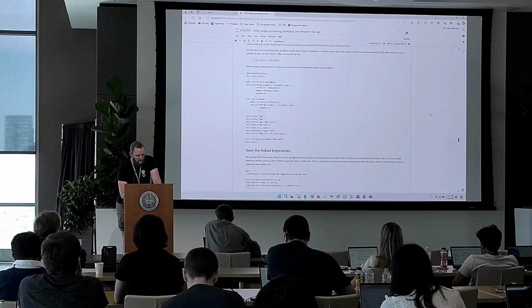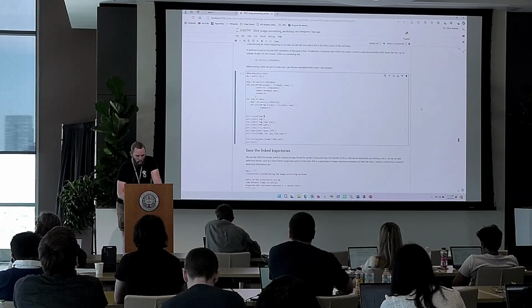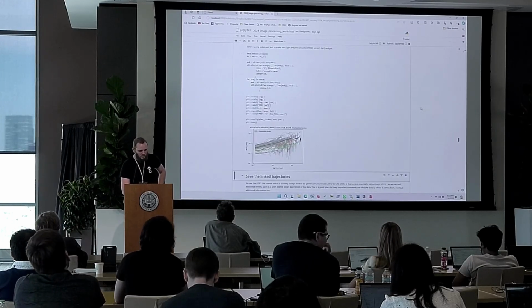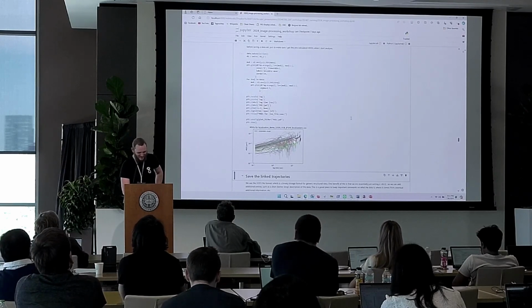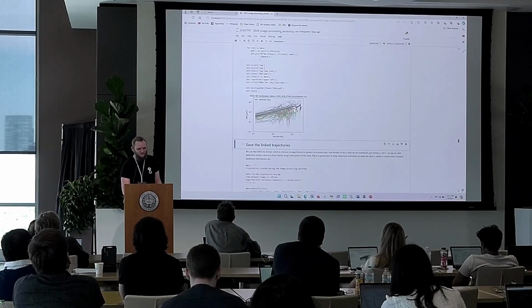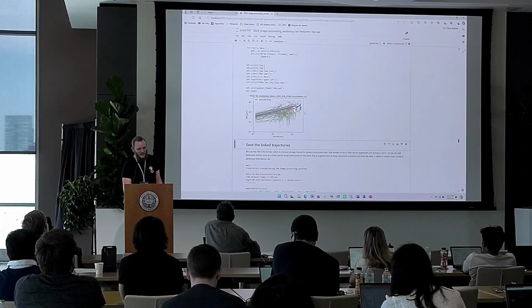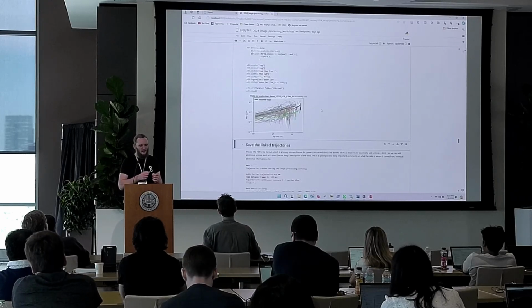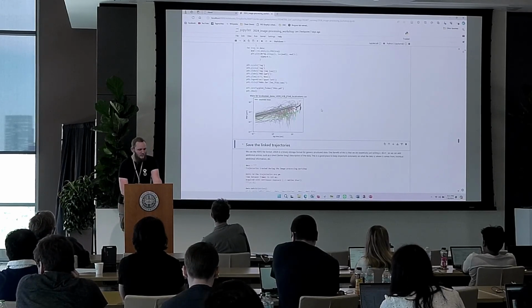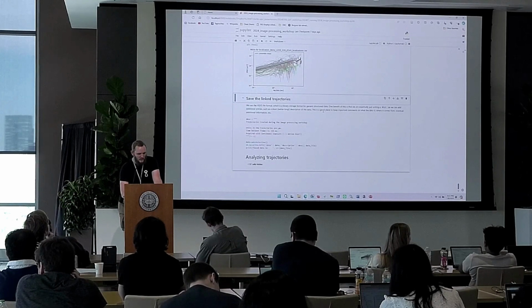Before we conclude the second section and transition to the analysis, let's do one analysis step already and just plot an MSD curve. So this code does that. You can look into it if you want. At the end of the day, this is the plot that we get, where each colored line in the background is a single trajectory MSD, and the black line is the mean square displacement for the ensemble of trajectories that we linked from our movie. This is one of the things we want to look at in the analysis section in a bit more detail. So let's get into that.